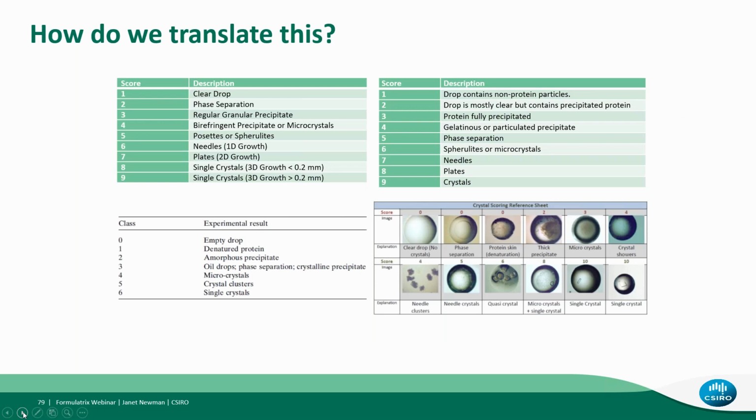So if we're going to try to translate the outcome of a crystallization experiment into a scheme that can be used for data manipulation, there needs to be some sort of standards of how to do that. And if you look on the web for ways of interpreting a crystallization image, you will find some interesting information. None of it actually matches. So there's no consistent set of rules for interpreting a crystallization experiment.